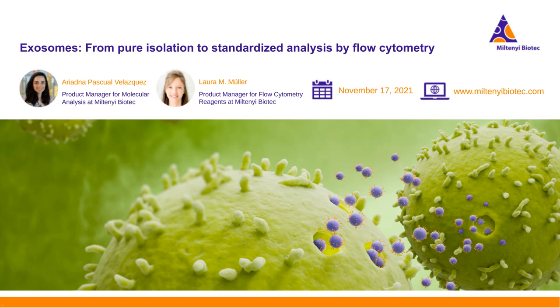So far, we don't have release antibodies for the exosomes, so this is something we are working on. The current setup of the beads is not releasable, so the vesicles stay on the beads. But you can elute the vesicles from the beads if you lyse the beads. For RNA analysis or protein analysis, you can do the lysis on the column, then the beads stay on the column, and you lyse just the protein and RNA content of the vesicles during the elution, and then go for downstream analysis, and you can exclude the beads.